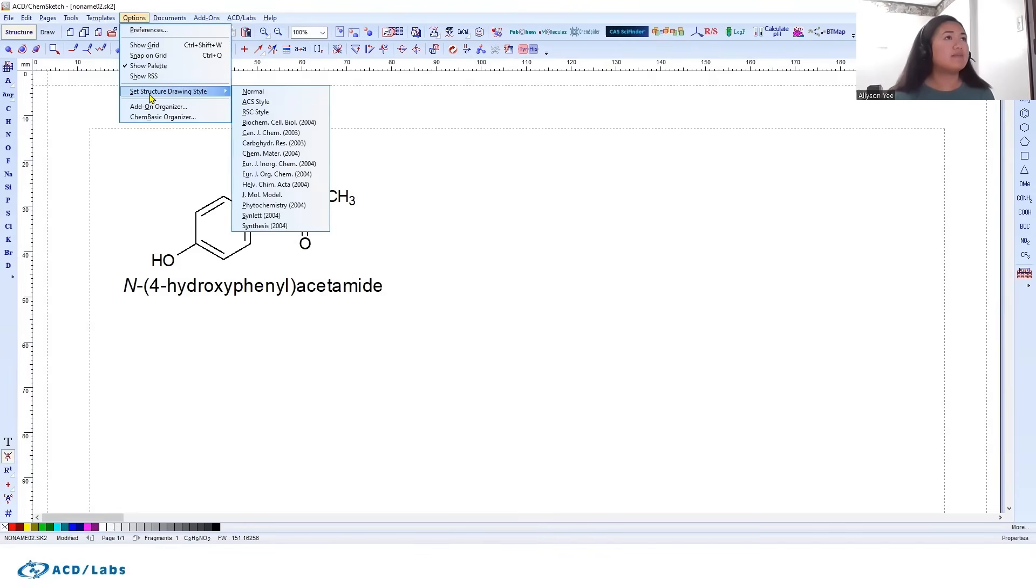the toolbar, we have the ability to set the structure drawing style. You see right now we're in normal, but we have the ability to change the drawing style for all of these different journals: ACS style, Biochem Cell Biology, Carbohydrate, Photochemistry, Synthesis. If you plan on publishing to these journals, you can simply click any of these templates and you'll start drawing in this specific style.